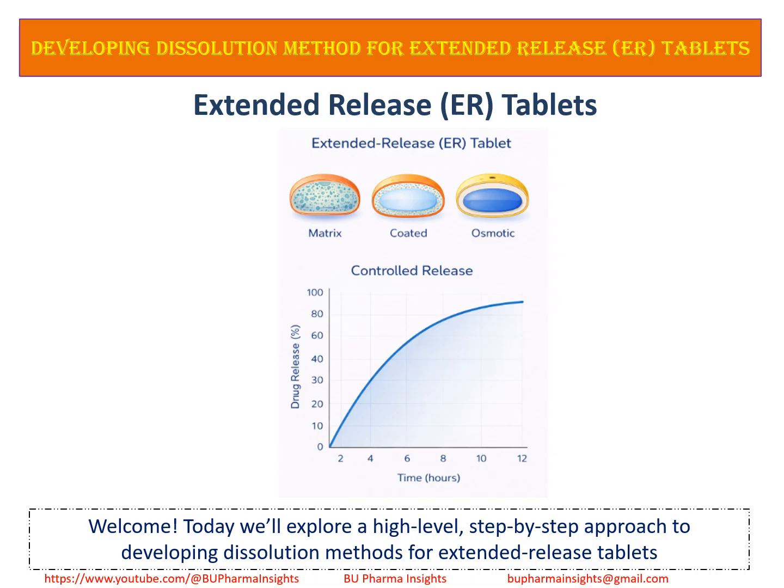For ER tablets, the method must mimic gastrointestinal transit, capture the true release mechanism, and demonstrate controlled release across the entire dosing period. This means different media, longer test duration, carefully selected time points, and appropriate hydrodynamics. In short, ER dissolution method development is about control over time, not speed.